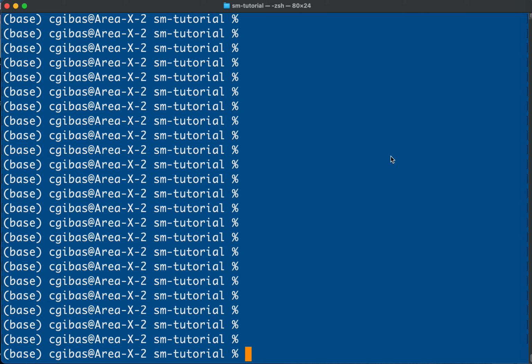And a heat map is a common exploratory visualization of your metagenomic data, which is a good starting point to think about what else you might do. And then in the workshop on April 15th, we will get into some of the statistical analysis that you can do with those abundance tables.